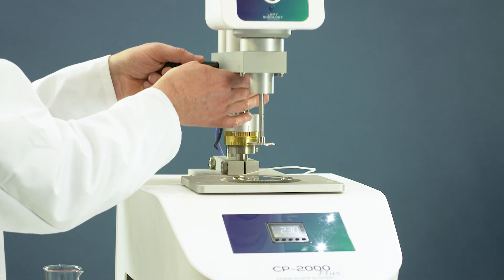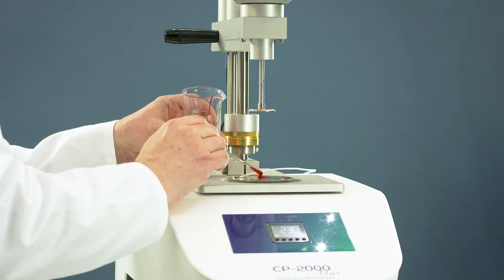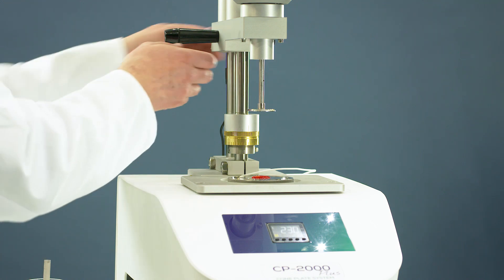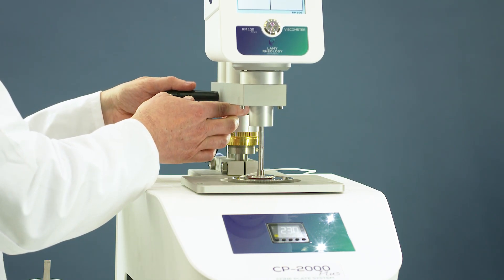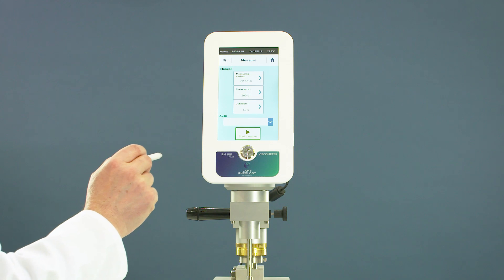Raise the measuring head. Place the sample on the lower plate. Move down the measuring head to the memorized measuring position. Go to measure, select your method, and start your measurement.